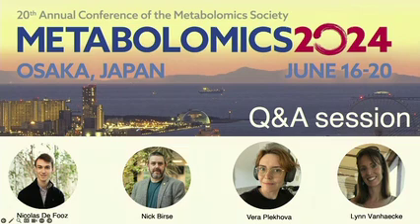I mean, on the point of the single point lock mass correction, I have sat in Waters headquarters in Wilmslow and begged them to do a multiple point lock mass correction algorithm and to introduce the standards necessary to do that. So I completely agree with you, because the correction you're going to do at 1,000 Daltons versus 100 Daltons is going to be different, and it would be nice to have multiple points. So I really like Agilent, because they have multiple reference masses that you can use for their correction. So yeah, I completely understand your point and agree.